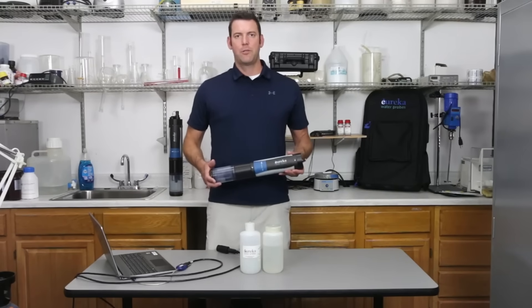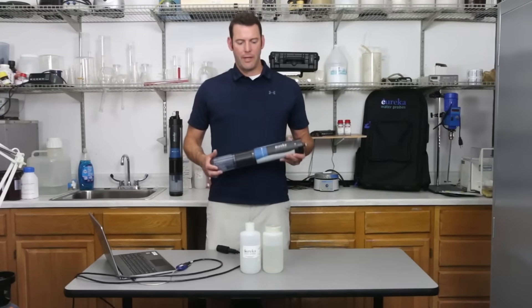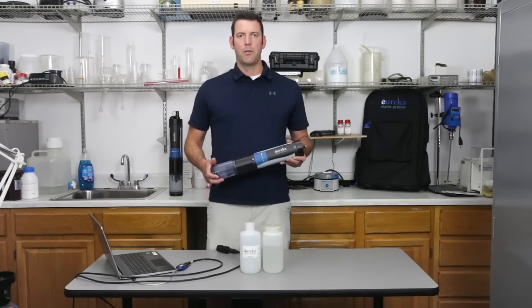Hello everyone. Today we're going to do another instructional video for you. We're going to calibrate our turbidity sensor on this Manta Plus 30 multi probe.